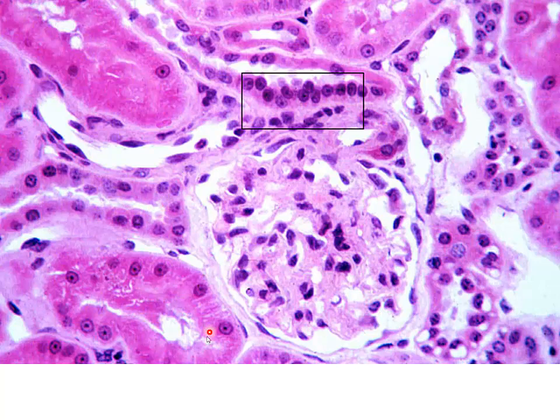Now, in this particular section, you can see the nuclei really have these dark spots in the middle of them, and you don't see as many nuclei. You can't really distinguish the borders of these cells, and the lumen is somewhat occluded. This is going to be a proximal convoluted tubule. Here we see more of the proximal convoluted tubule. It goes out of the plane of section. More proximal convoluted tubules, but all the rest of these are going to be sections through distal convoluted tubule that we're looking at here.